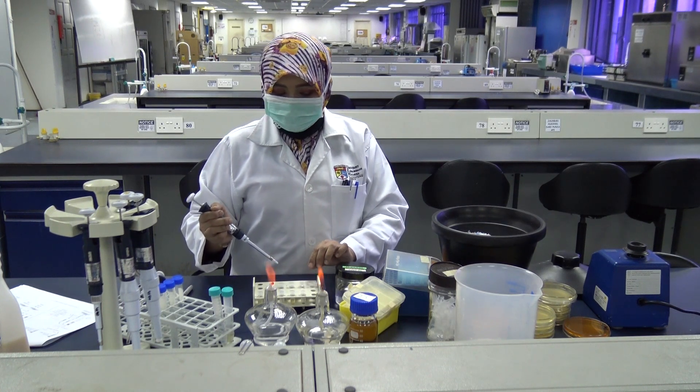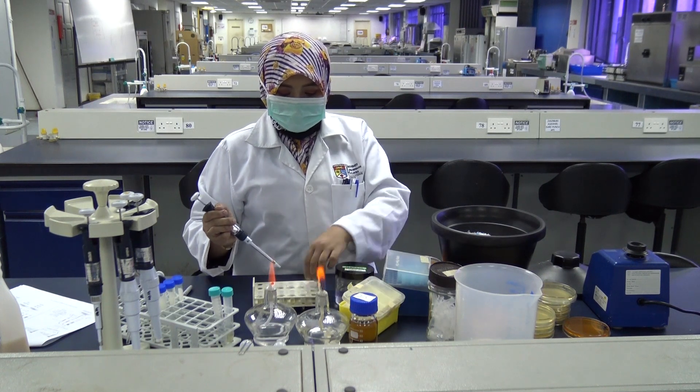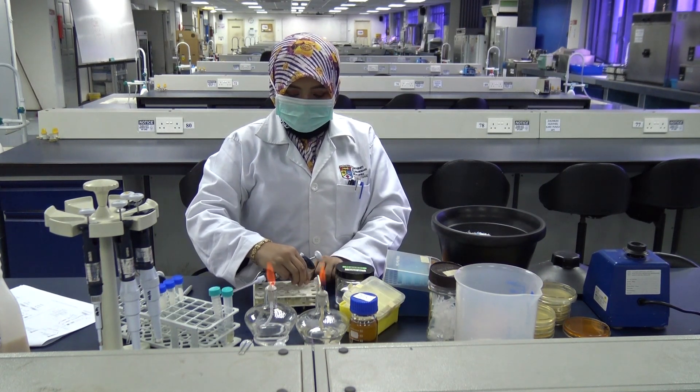So we've come to the end of the first part of this experiment. We have completed the plasmid transfer by conjugation.